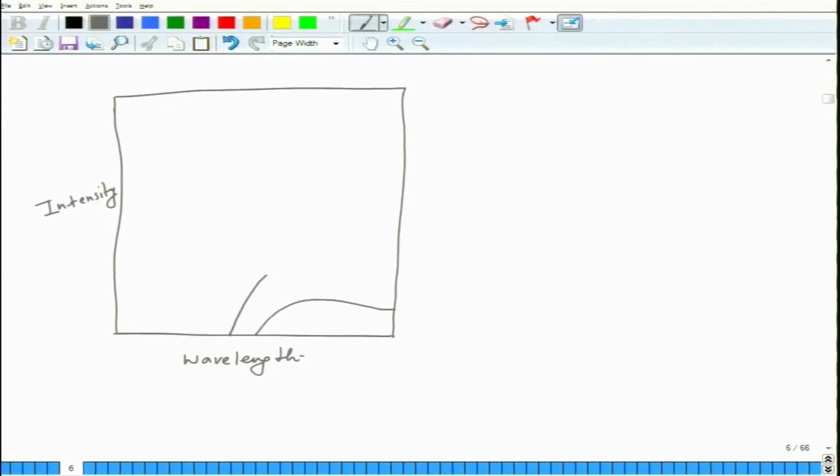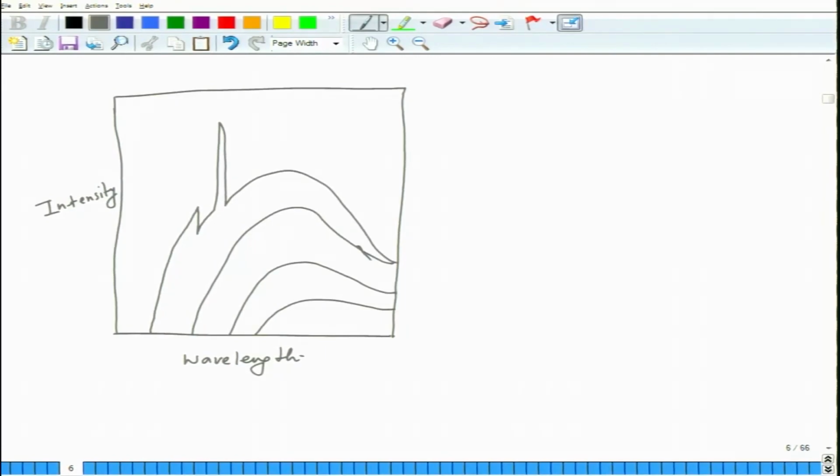So these are lines, and then suddenly at certain points you have these. Actually they go more steeply here, it's a far steeper drop. So this is basically as a function of voltage. So this is 10, let's say 15, and this is 20, and this is, let's say, 25 kV. Okay, so this is kV, kV, kV, and you will have 5 somewhere here, let's say 5 kV.